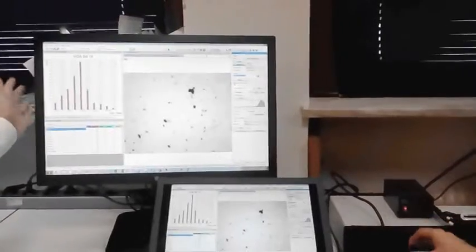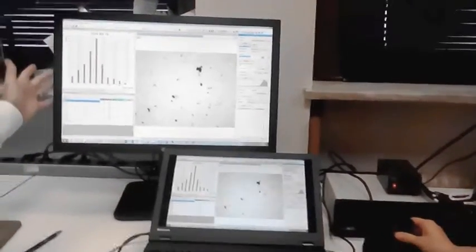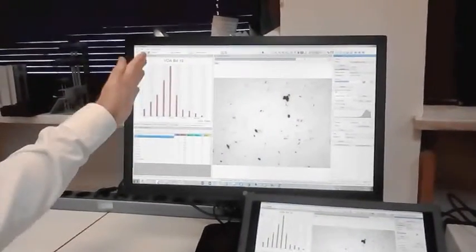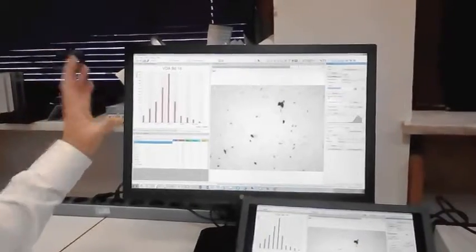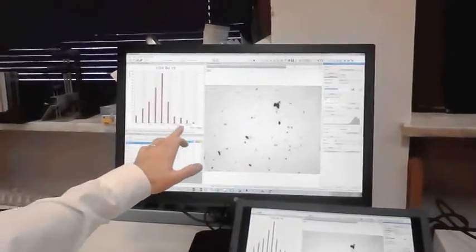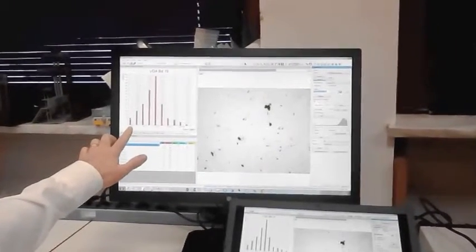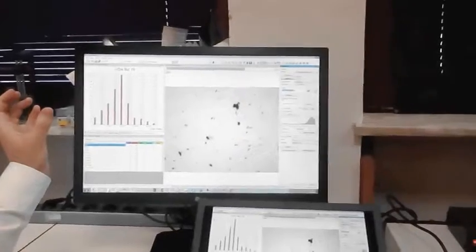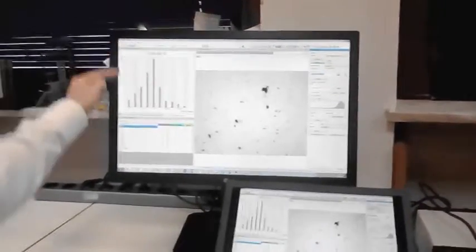So we've preloaded one of the most common standards here, which in the automotive industry would be VDA BD19. And this, you can see the red lines here show us exactly what the specification demands. So we have different size classes of particles here, so 5 to 15 microns, 25 to 50, 100 to 150, these are all in micron sizes, and then also the count.